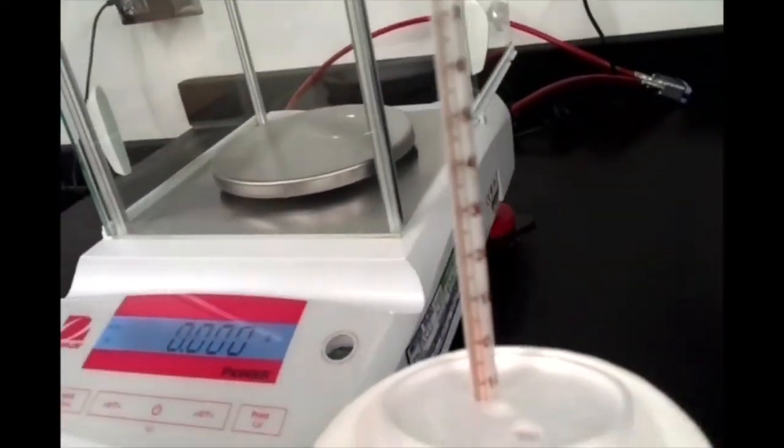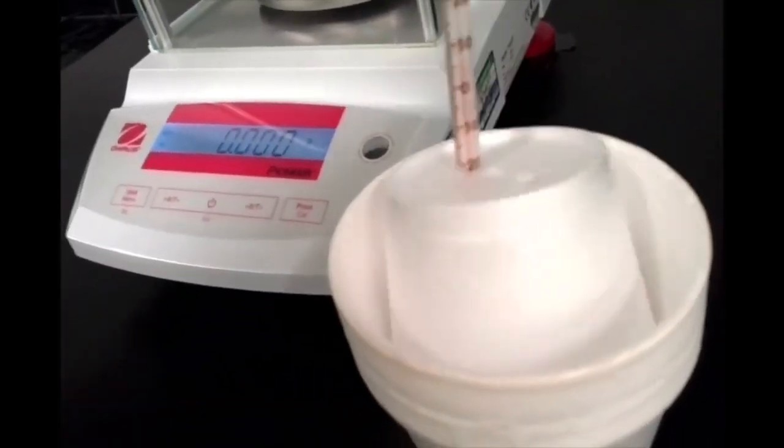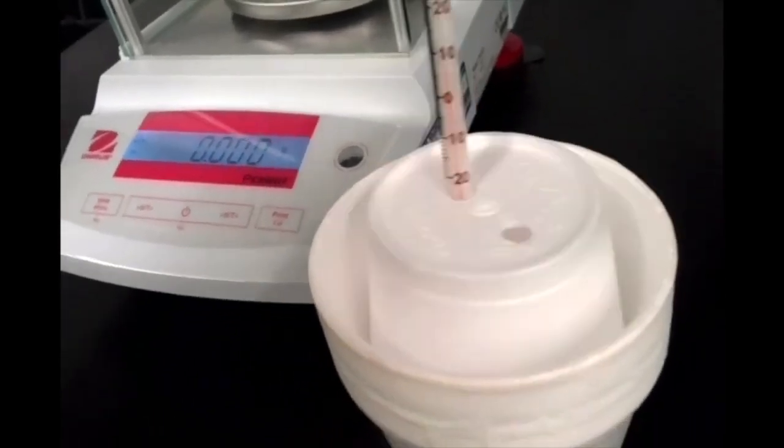Looks like we're down to about 7 degrees or so. Let's have a peek in here and see if we still see some ice in there. Yeah, it's still a little bit of ice, so hopefully that'll melt a little bit as I stir it.